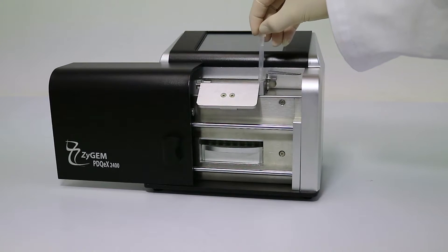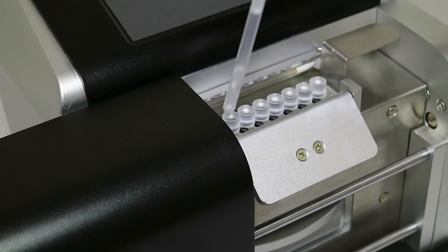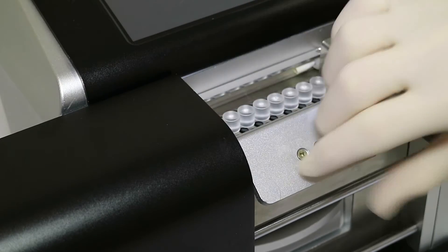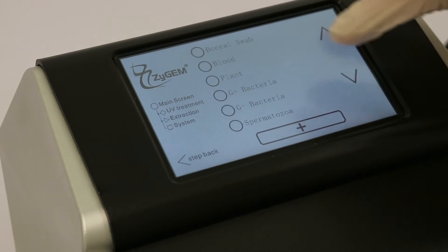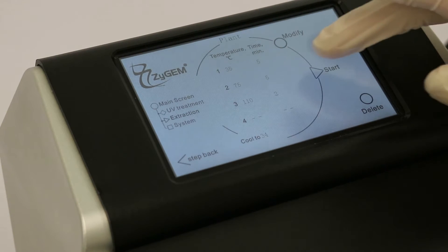These are the only consumables used by the PDQX. Once the tubes are loaded, the instrument is closed. Different programs are provided for different substrates, but the instrument is fully programmable.